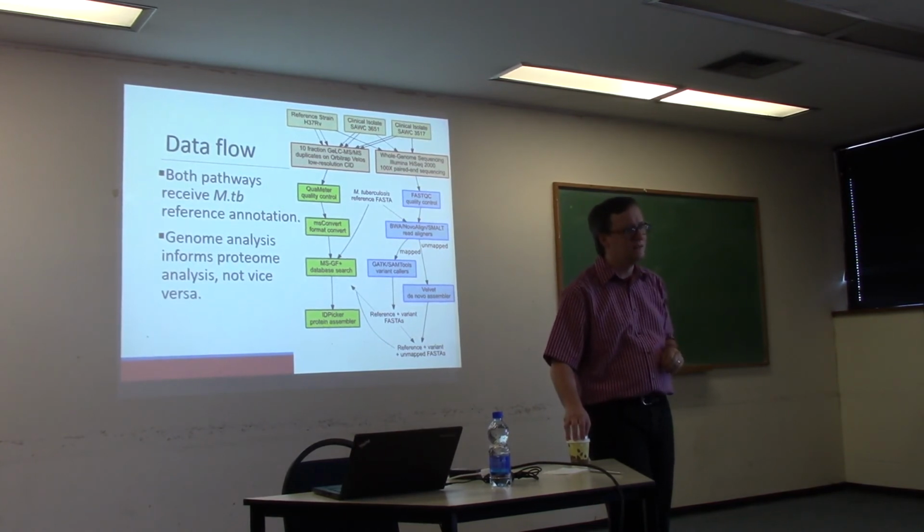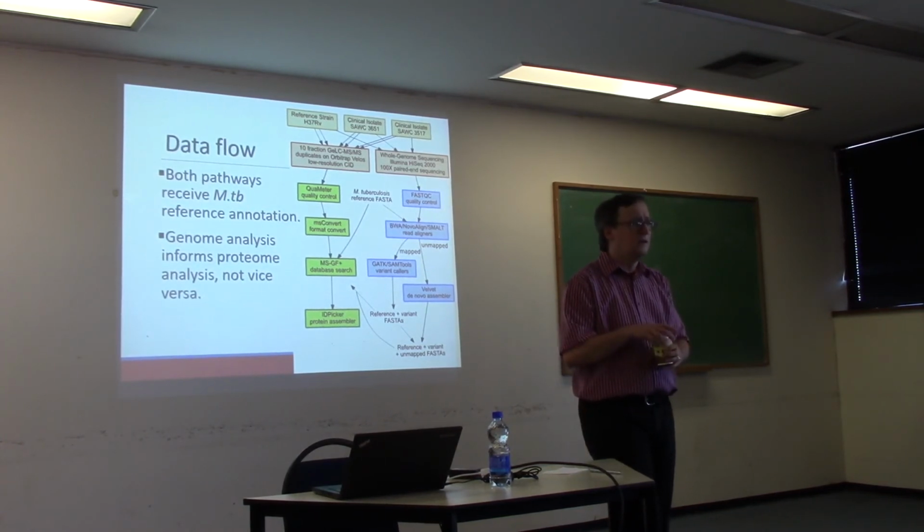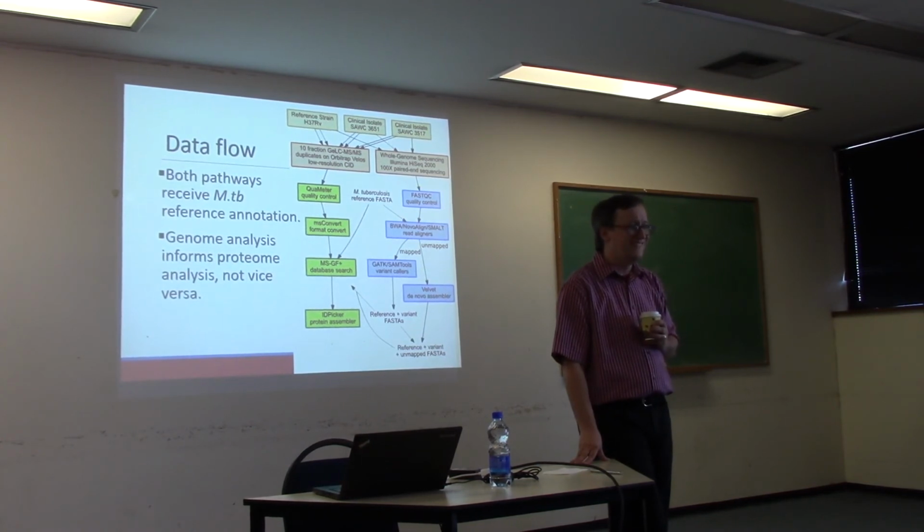Yeah, I guess what I'm asking though, if you're looking for those transcripts, if you're trying to identify which part of the genome is actually coding, are you growing them in enough conditions that you're going to get those rare things expressed?